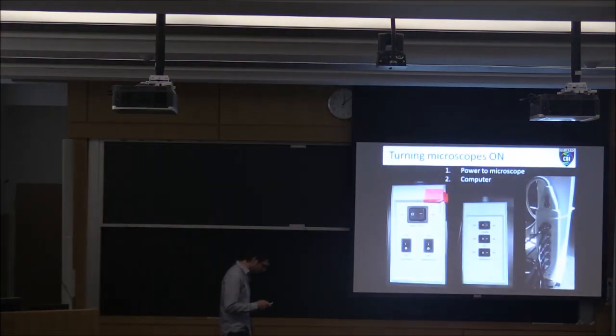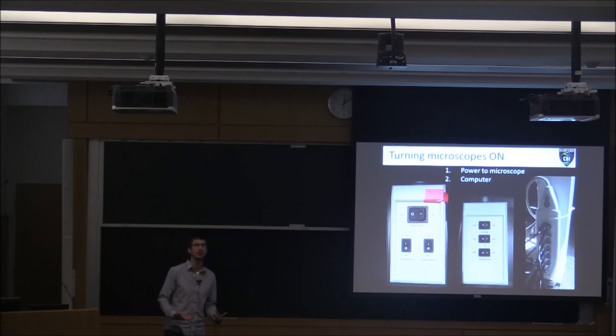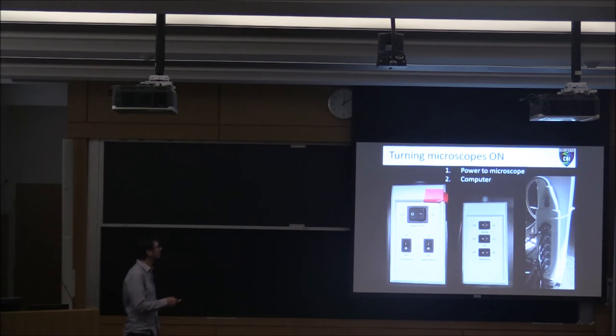How do you turn the microscope on? This is pretty straightforward, but with all of our systems you want to make sure the power to the microscope is turned on first before you turn on the computer. Usually the systems have one of these power switch boxes, or everything is plugged into one or two power strips on the legs of the air table. There are a few systems that won't recognize the components properly if that isn't done. When there's one of these white power switch boxes, start from the top and work your way down, and left to right — that's the correct order.